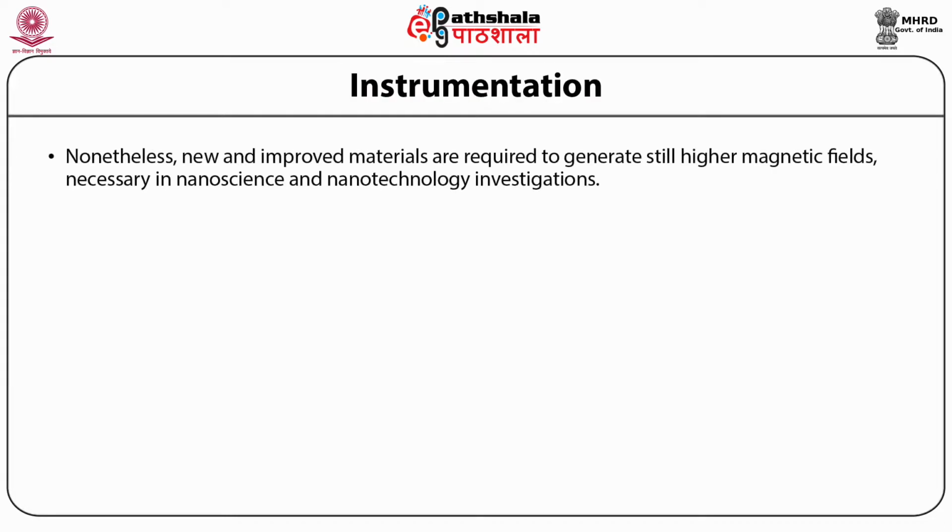Nonetheless, new and improved materials are required to generate still higher magnetic fields, necessary as nanoscience and nanotechnology are investigated. Furthermore, the magnetic field must also be homogeneous.